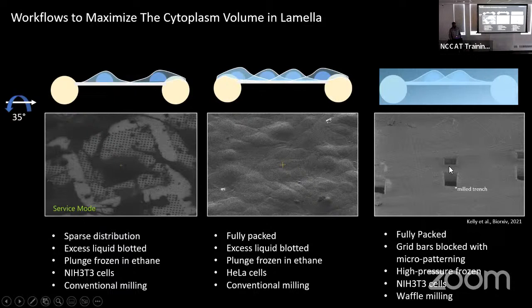Yeah. So why don't you just grow cells on the other side? Yeah. It's just that experiment. I did it on this side. I think, this was a while ago, so if I put it on the other side, I would have gotten more ice on top of the cells. I think that was my rationale.